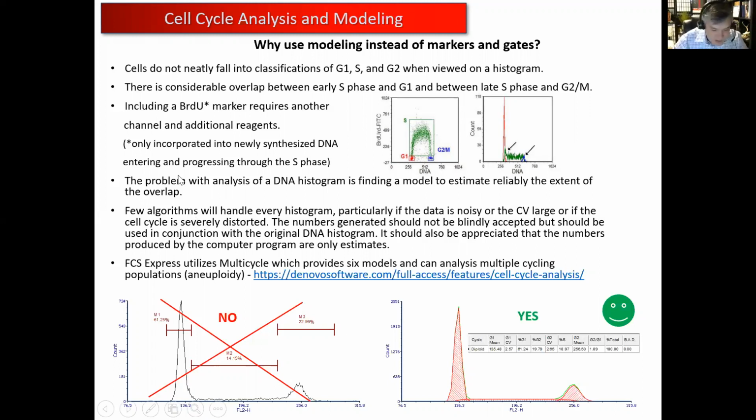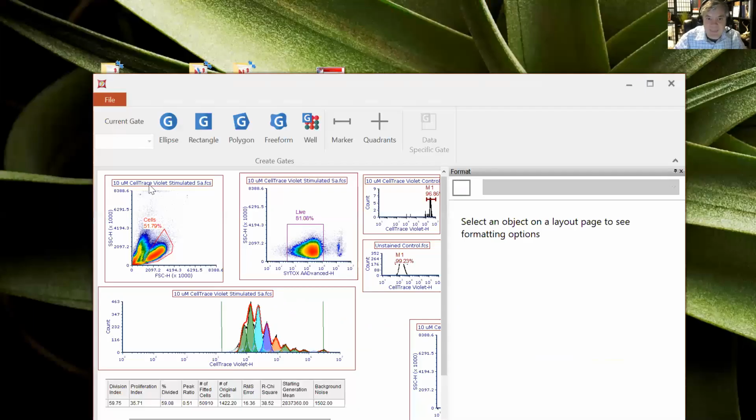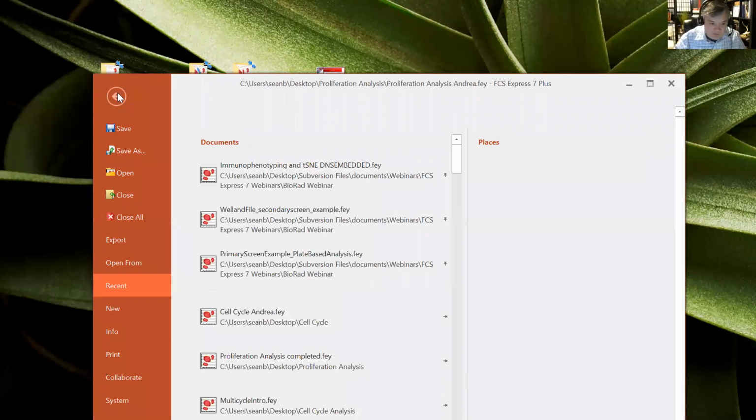So before we go in and analyze some data, are there any questions that came up? I think I saw the chat screen flash for a second there. No, I think we're good on questions right now. Great. But again, to everyone, please feel free to use that chat function if you do have questions.